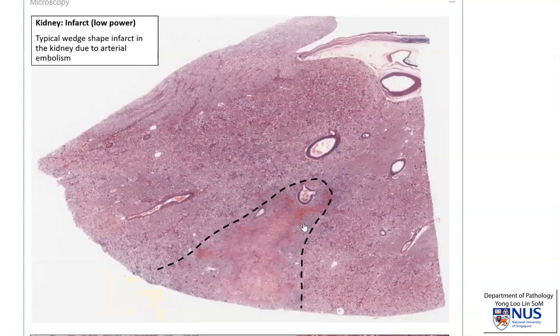Here is what the infarction may look like microscopically. We can see a vague wedge-shaped area that looks a little bit different from the rest of the kidney. Just to orientate you — this is the renal capsule, this is the cortex, this is the medulla, and over here is the renal pelvis.